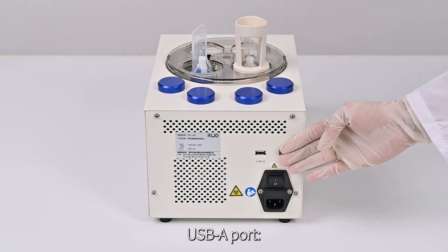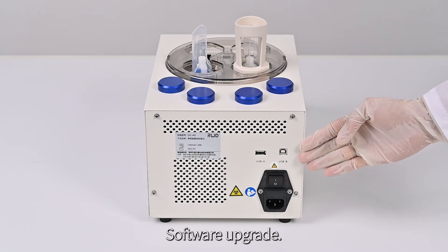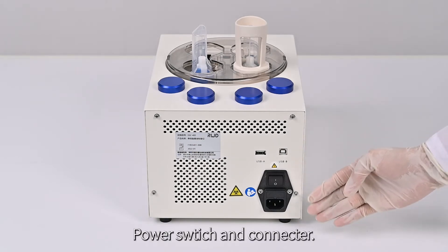USB-A Port: for program import and export. USB-B Port: for software upgrade. Power Switch and Connector.